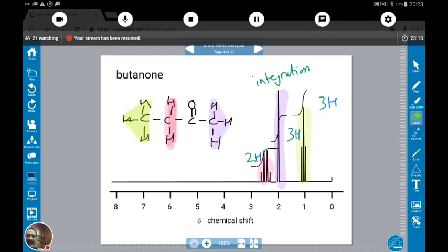Now, what we say in NMR speak is that there is no carbon with hydrogens on it which can split this particular signal. So you can see this signal remains unsplit. It's just a normal single peak and it stays a single peak because the neighbor next to it can't interfere, and neighbors can only interfere if they've got hydrogens on them. So there are no hydrogens over here, so it can't interfere with this over here. Over here, the difference is that this has hydrogens and this has hydrogens, so these hydrogens will interfere with this hydrogen pair, and these hydrogens here will interfere with that. And we, as analytical chemists, must be able to predict whether we have splitting, as in the case over here and here, or whether we don't have splitting in the case of this CH3 over here.